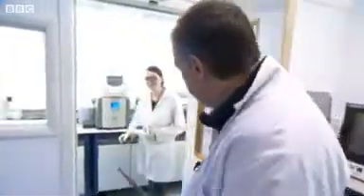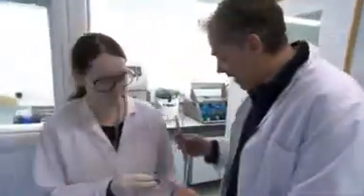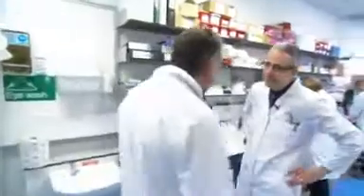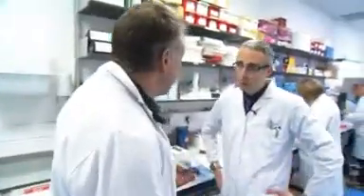That all starts in this room, where this machine is actually extracting the DNA of samples like this, comes out in liquid form, so more work can be done. The scientist in charge of the whole program here is Dr. Paul Beals. Paul, you've got a big project on your hands here. Tell me about the work you're doing.